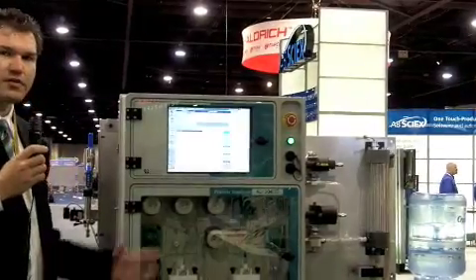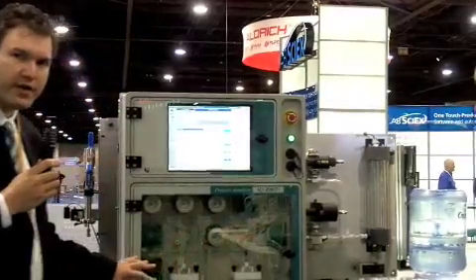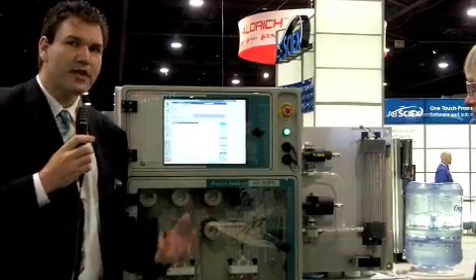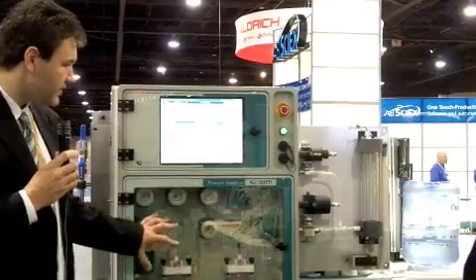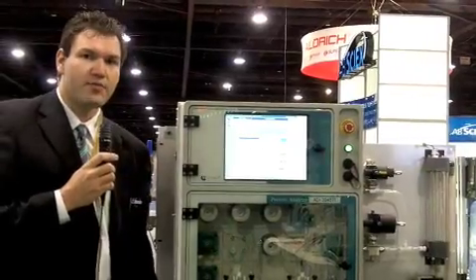Here in the system we have various components. These components are arranged in a flexible way. We have a large selection of different components, and depending upon the demand of the customer, we create an individual set of applications and define the different components accordingly.